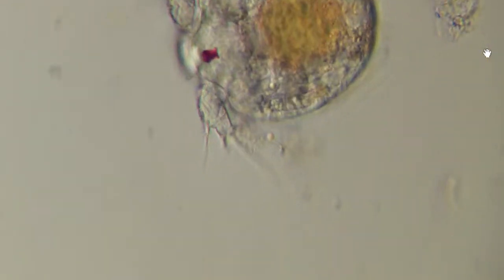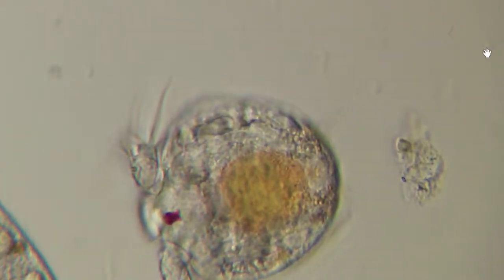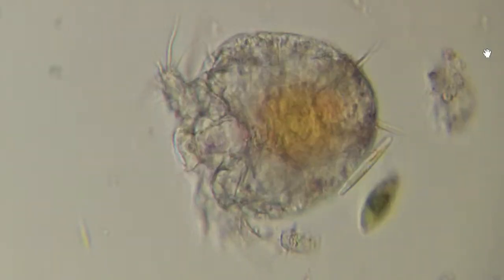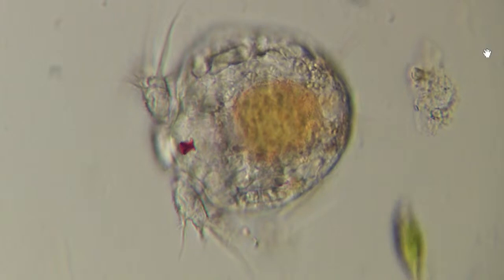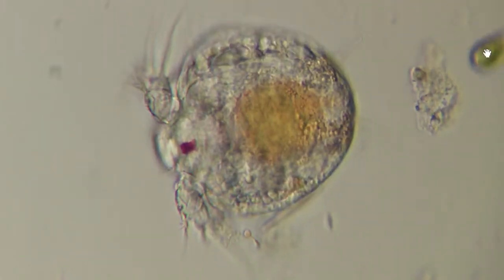Ooh, look at that little guy too. That is a little larval stage of the copepod. So he's got the eye spot and little tiny buds. You gotta find all kinds of stuff on this slide. It's a great slide. So this larval stage of the copepod.